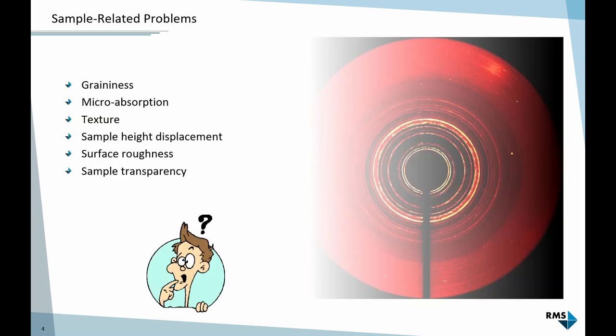There's a whole list of things we can do wrong: graininess, microabsorption, texture, sample height displacement, sample roughness, sample transparency. I want to go quickly through all of these to show you what the problem is and how it manifests in the diffraction pattern.